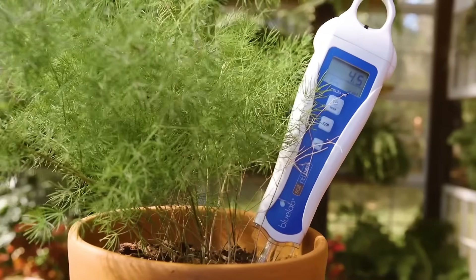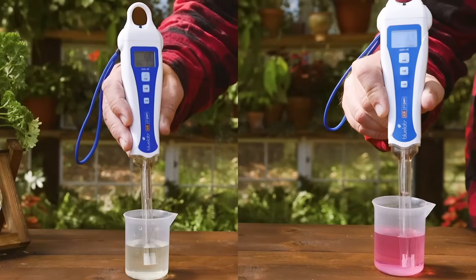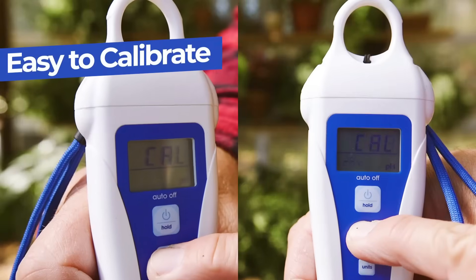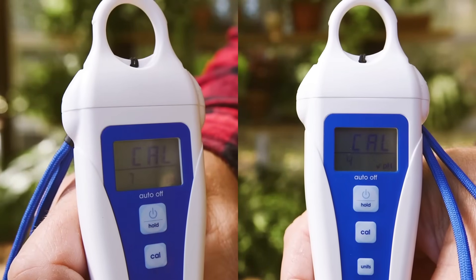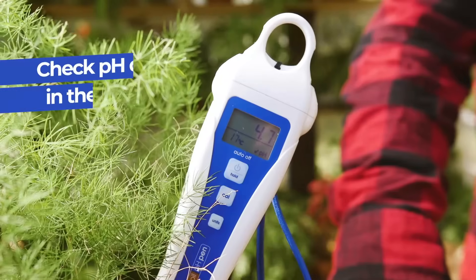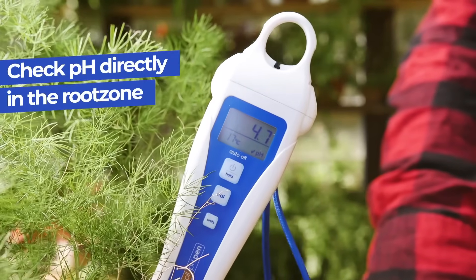Measure soil or solution with the soil pH pen by Certified MTP. With its simple two-point calibration process, you can get accurate and reliable results quickly. Just insert the pen in the root zone of your plants to assess the pH of your soil.